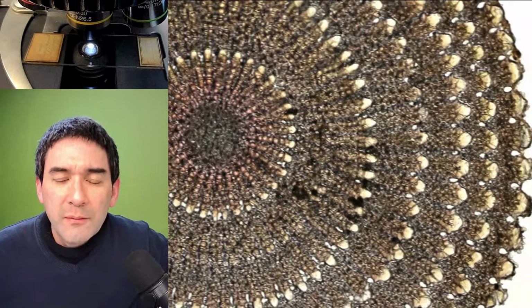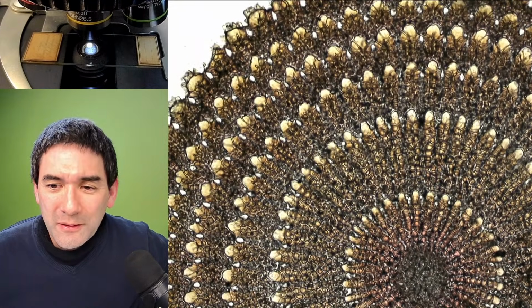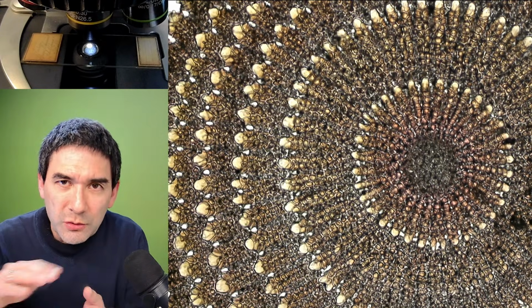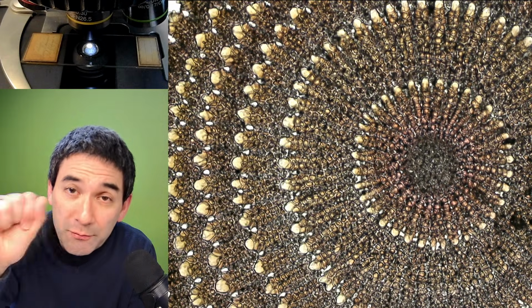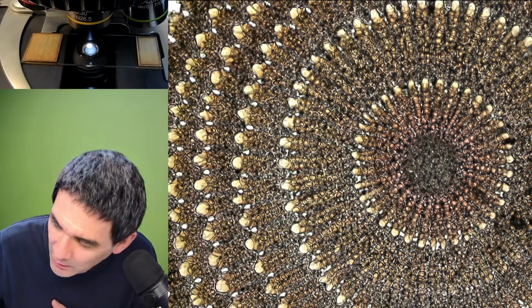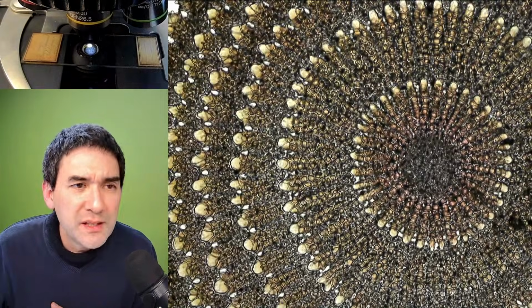Again, if you've been watching some of my videos over the last couple of months, I've already shown them before. Looks very nice. But again, as I mentioned already, it's a bit of a miracle to me how they were able to do that. I think what they've done is they've glued the sea urchin spine on the slide and kind of polished it down, right? So that's polarization. Right now it's not polarized, because I pulled out the polarization filter, and also the prism. So right now it's just regular bright field.